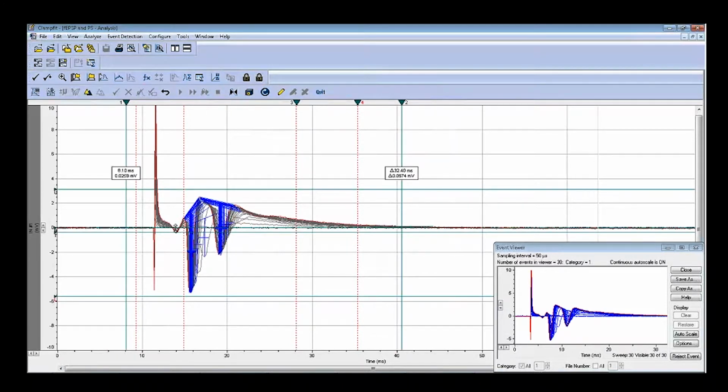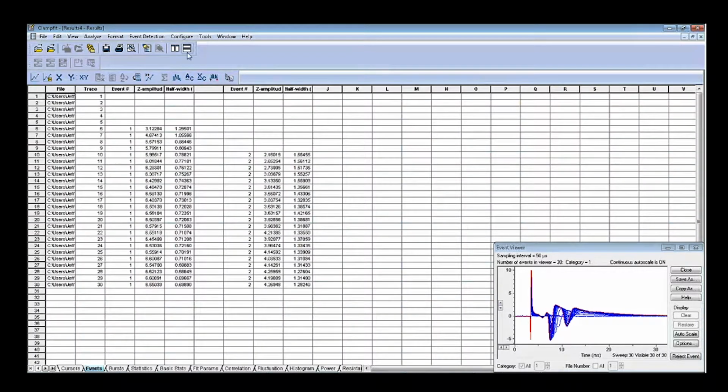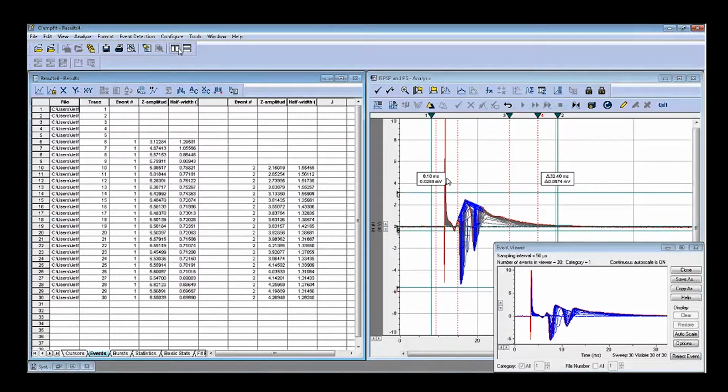Now you can see the data is much cleaner here. I don't pick up anything here too. Now look at the data. The data will be in the result sheet. Now we can go to this one. You can see clearly, right.